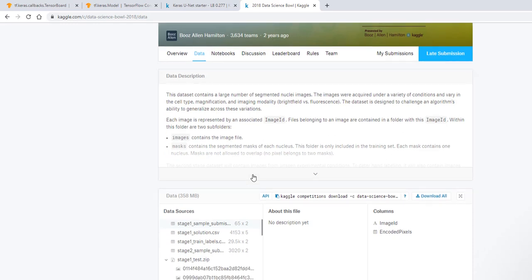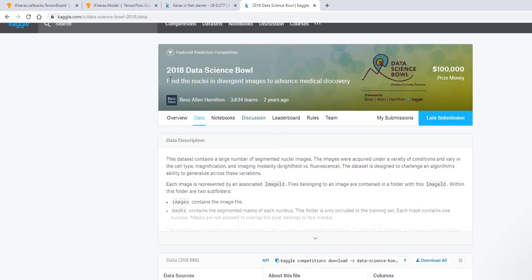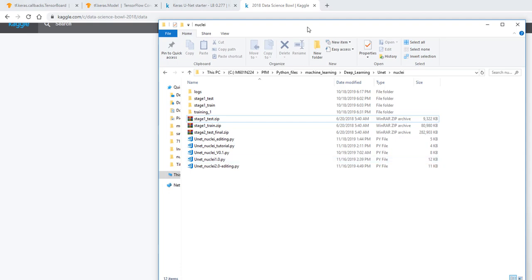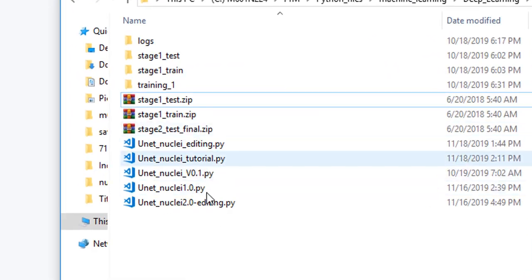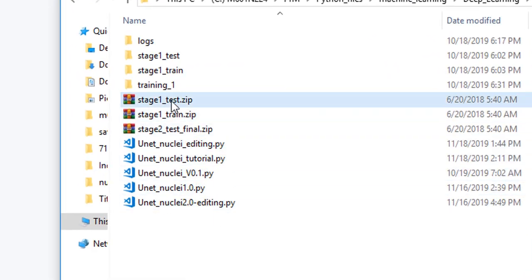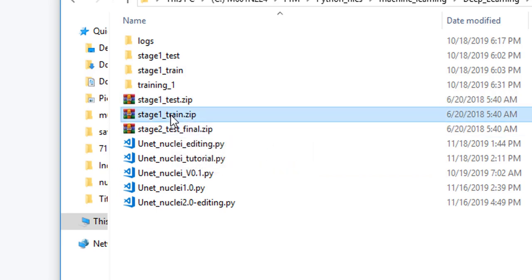When you download this from Kaggle.com — just search for 2018 Data Science Bowl and sign up — download this dataset. When you unpack it, it looks like this, without the Python files. You'll have stage one test and stage one train.